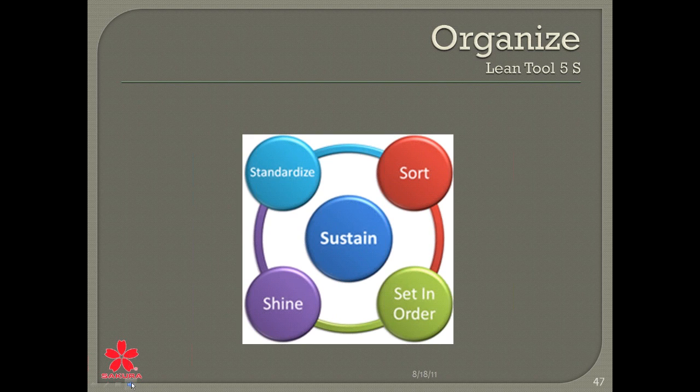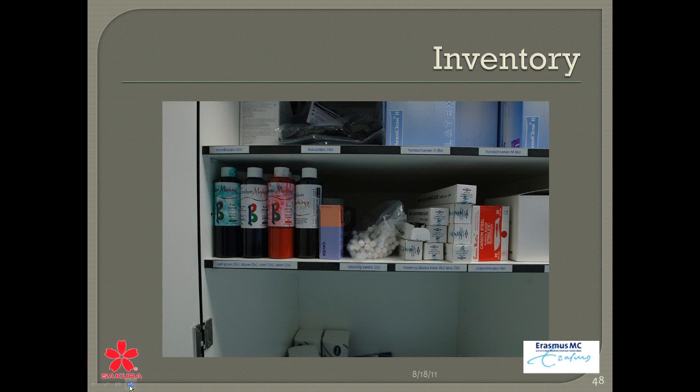And that's when you have people that are moving the stuff around. Try this. And that's what we did with our inventory. We put these little tags, and on there is also the amount that has to be in this closet for this stuff. So we had a lab technician that filled this closet because it was in the grossing room, and you don't want to go out of the grossing room and in and out and in and out. That's why we did it like this.